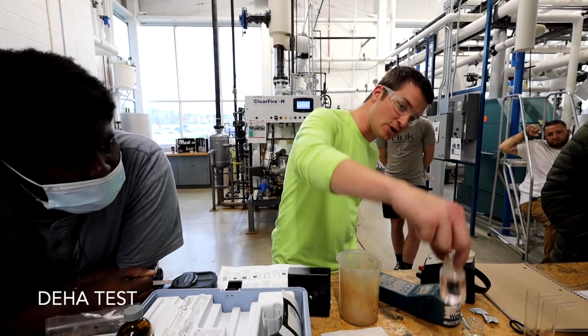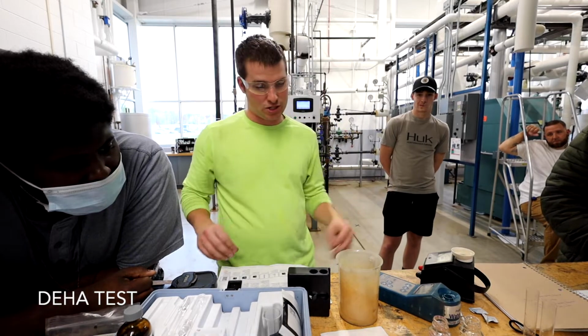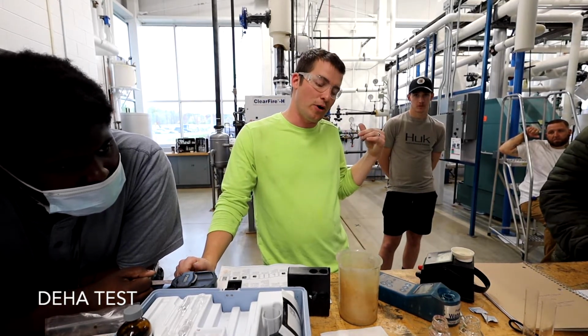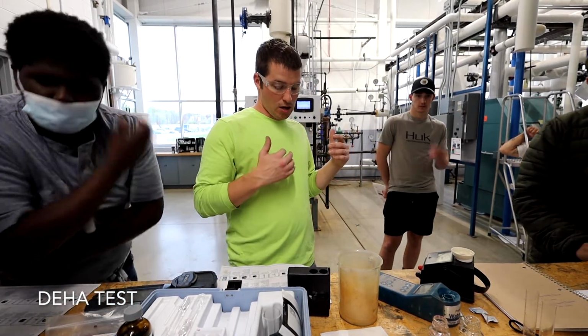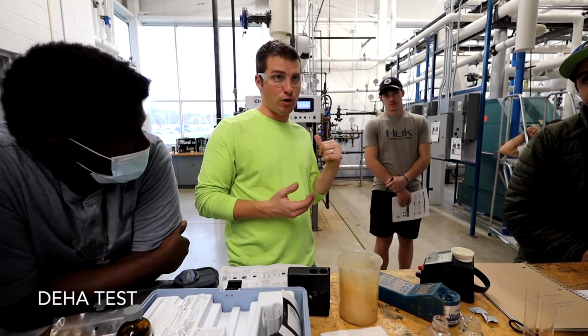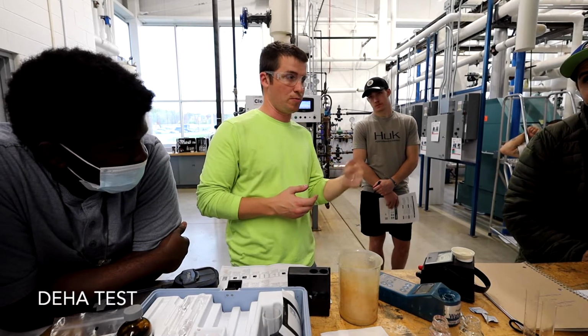So you can see this is starting to turn slightly purple compared to this one, which again, it's a slow turning test. I think it's going to be low, but the hard part is, how do we normally decide when to feed chemicals? Most places feed chemicals one of two ways. One, when your feed water pump is on and pumping water from the feed water tank to the boiler, it just turns on the chemical pump and it spins.